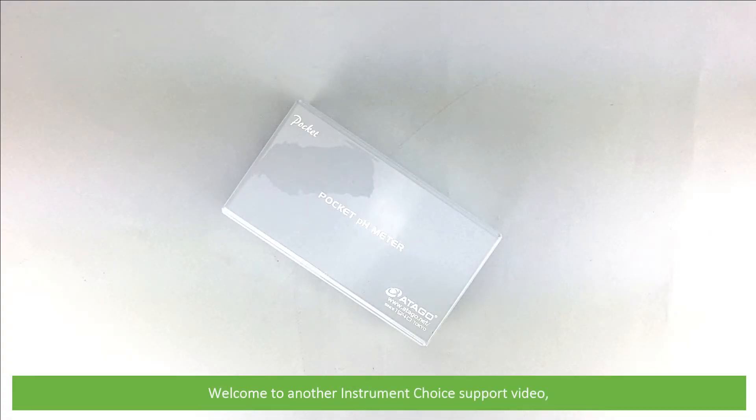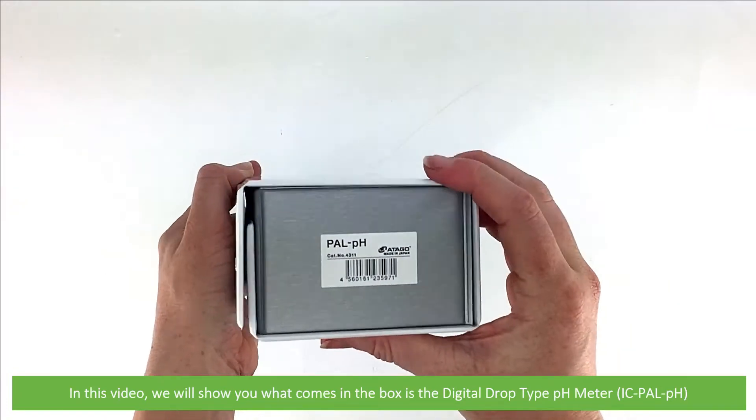Hi and welcome to another Instrument Choice support video. In this video we'll show you what comes in the box with the digital drop type pH meter, the IC PAL PH.